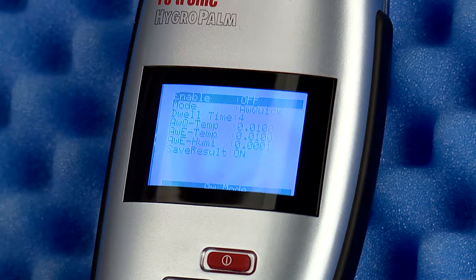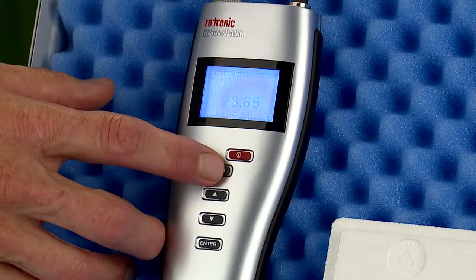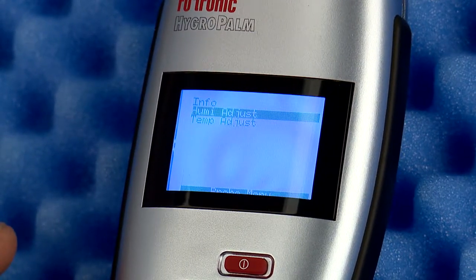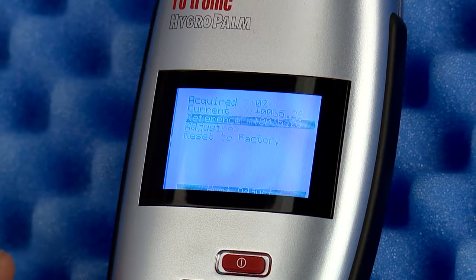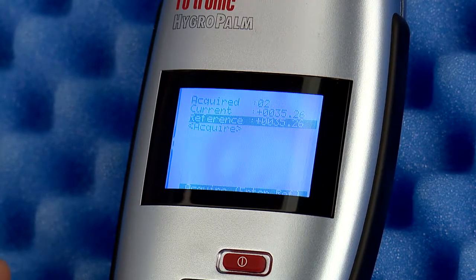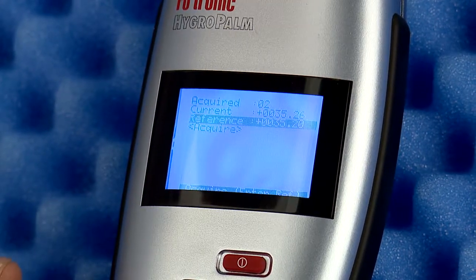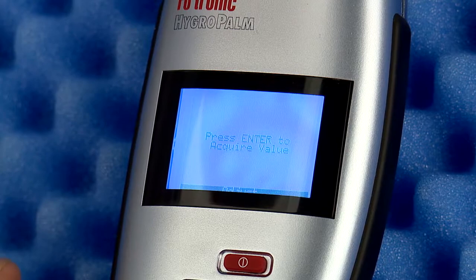Once the soak time has passed, it is time to check the point and acquire the calibration point. Press Menu again, navigate to the probe under calibration — probe 1 in this example. Select Humi Adjust, select Acquire Interref, select Reference, and enter the value of the humidity standard. Then move to the Acquire menu choice and press Enter twice. Operation Successful will appear and you are now finished with the first point.